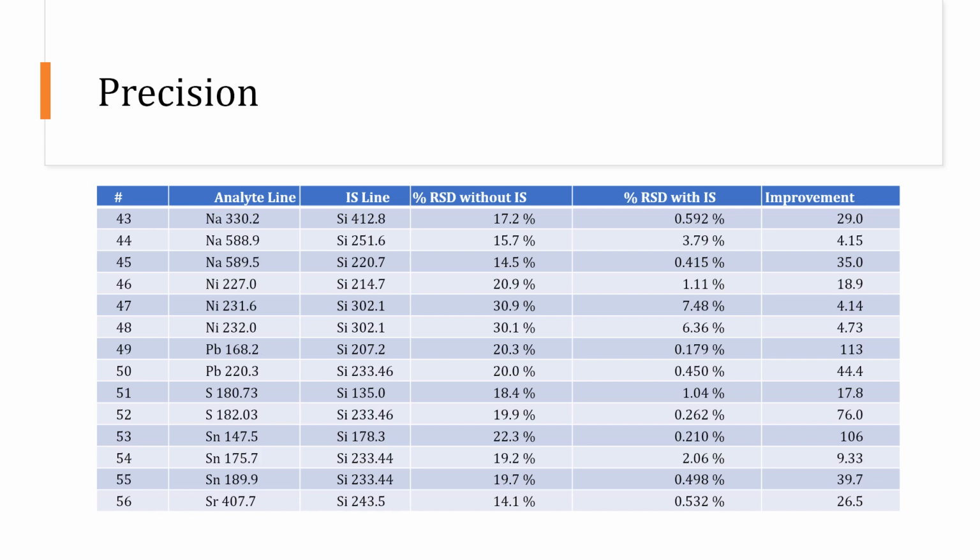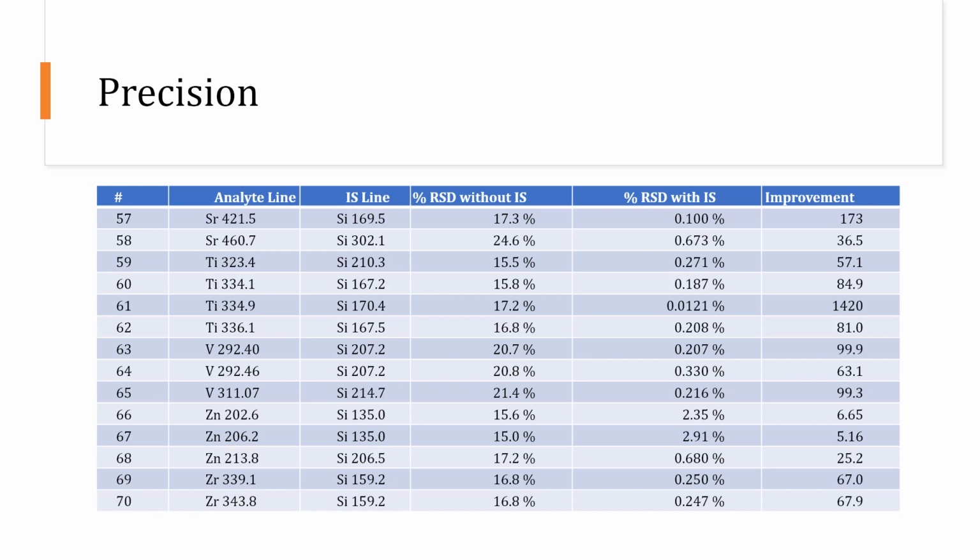Continuing on to sodium, nickel, lead, and sulfur, as well as tin, starting with strontium as well. Continuing with strontium, titanium, vanadium, zinc, and lastly zirconium.